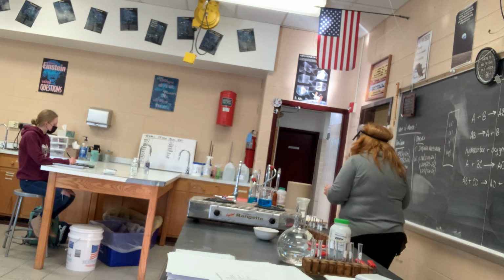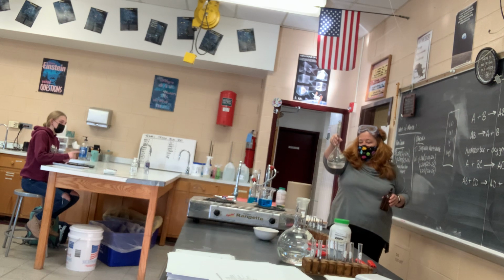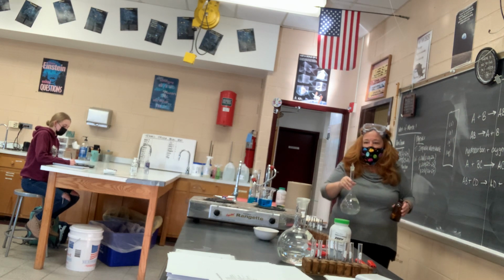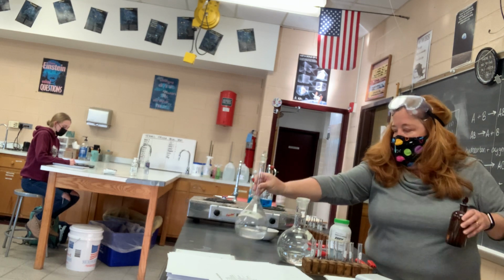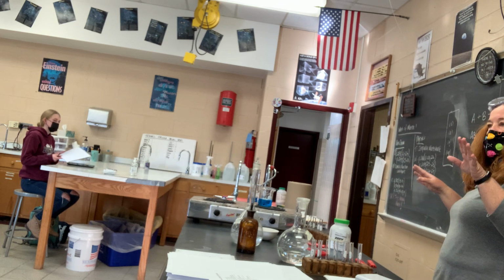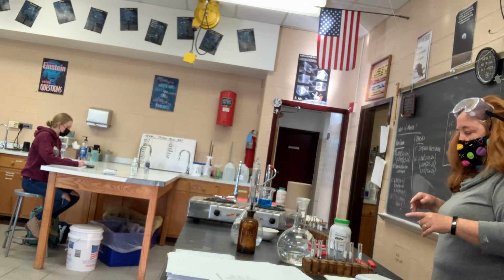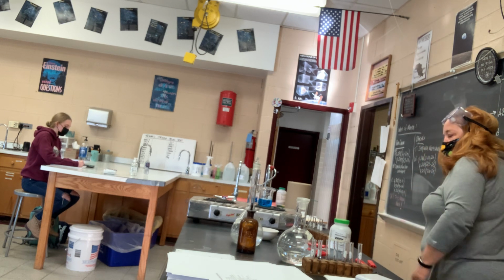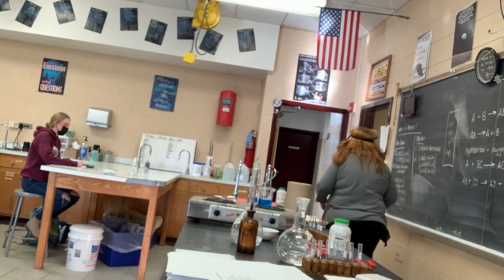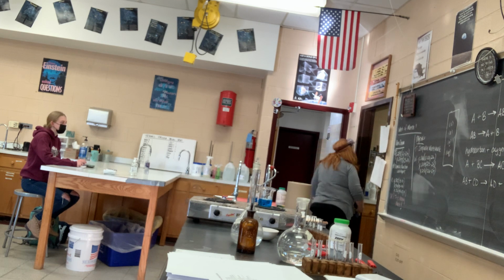I have silver nitrate and a salt water mixture. Once again, okay. And some other things living in the salt water. We'll worry about that later. Silver nitrate has to be kept in a brown bottle because sunlight will decompose it. It'll decompose back into silver. So I have to keep it in a brown bottle. I'm gonna go get some more pipettes, and I might go get cleaner salt water. That's Beckley water. I didn't use distilled water on that.